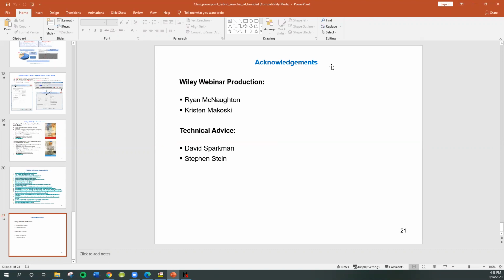Can I use the hybrid search with my user library and with older versions of the Wiley and NIST? If they're EI, you can. All you have to do is use that little pull-down under the tools, and anything that's not capitalized says it hasn't been formed into a hybrid library. You just select it and run it, and within 30 to 40 seconds, you'll have all the libraries converted to hybrid format. The rub comes with the MSMS.